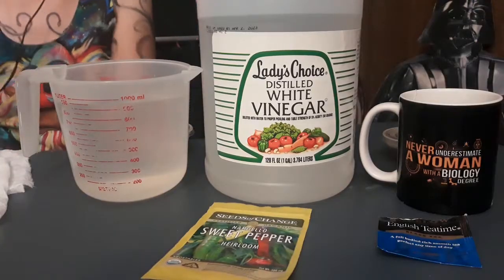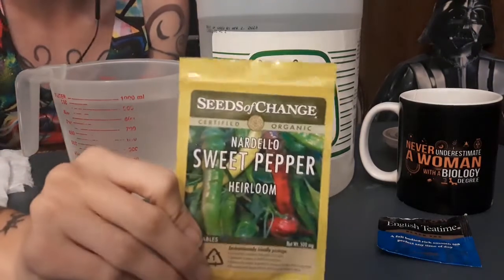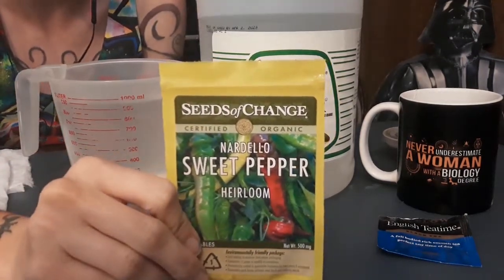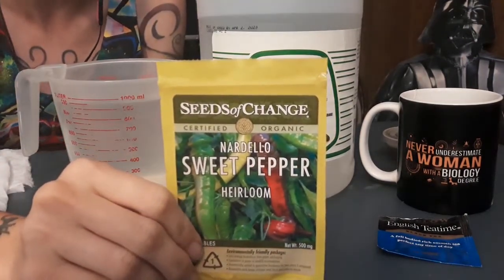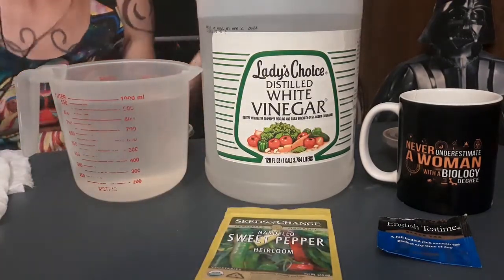We are going to try to simulate chemical scarification in pepper seeds. Pepper seeds are notoriously difficult to germinate sometimes, and so they can benefit from a simulation of digestion.